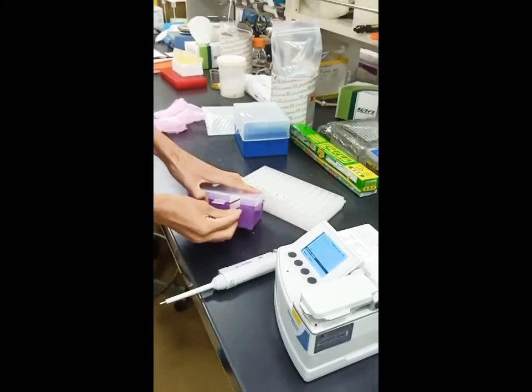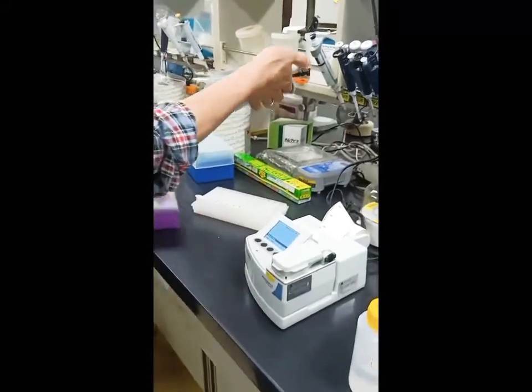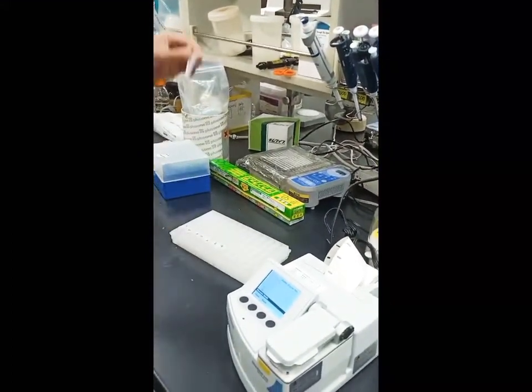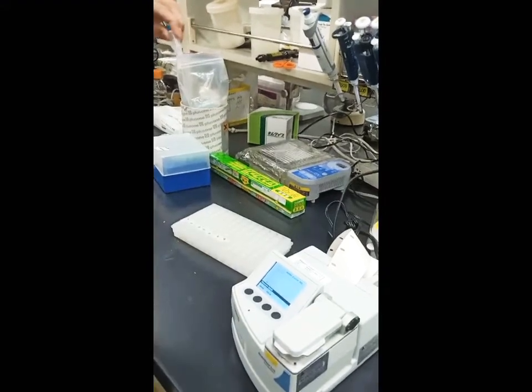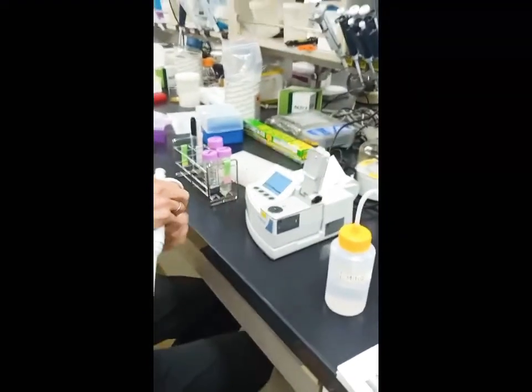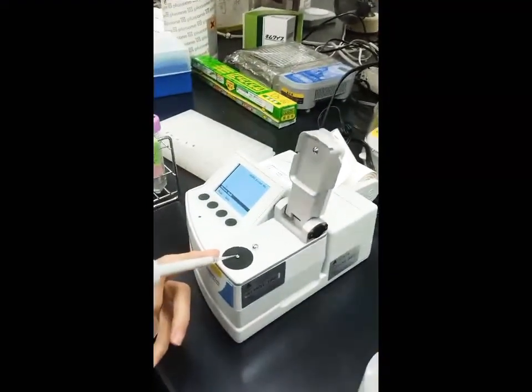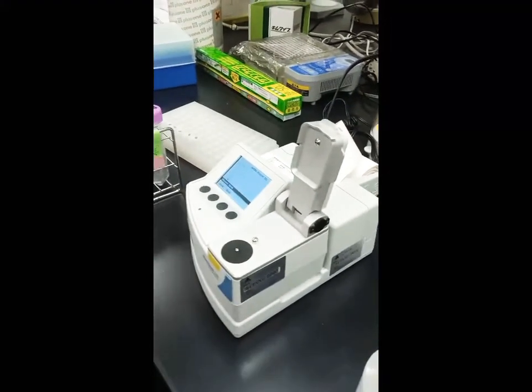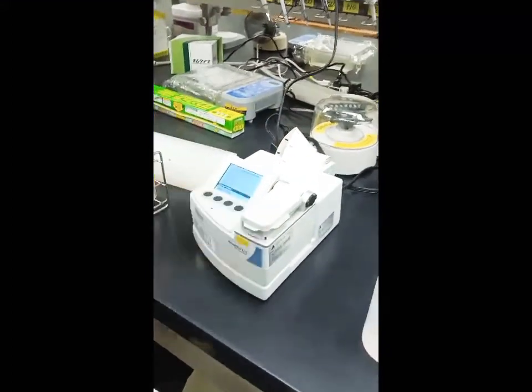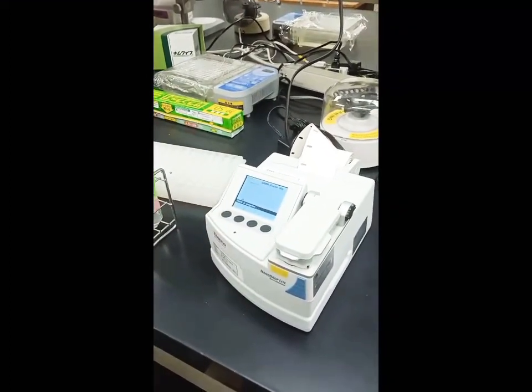First we need to calibrate this machine using the same solution you dissolved the DNA in — in this case, T-buffer. So we calibrate with T-buffer: put the drop of T-buffer on the sensor and select 'measure blank.' This is the calibration step.